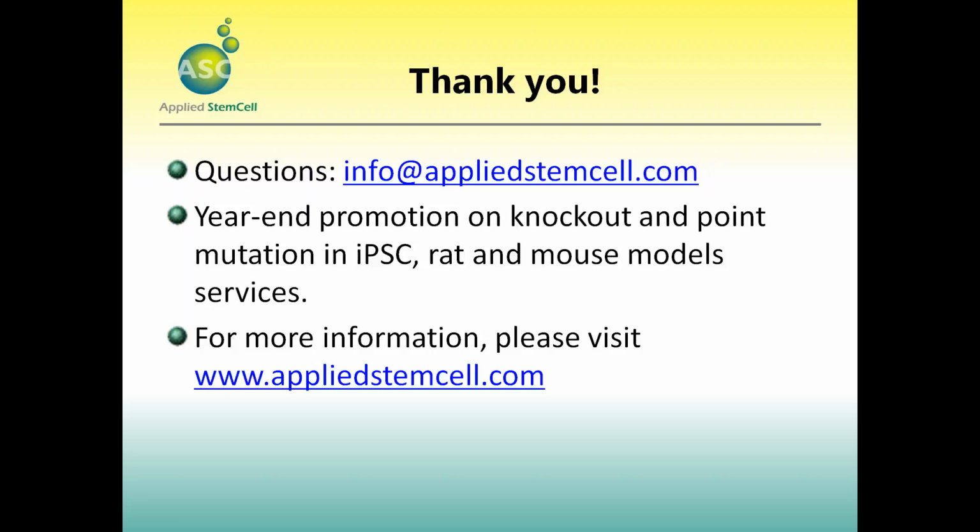So we have successfully inserted a 22 kb fragment without drug selection. And we are still trying to insert even larger fragments using this technology. And with a selective marker, as I mentioned, efficiency could be 100%, and without a selective marker, the efficiency could be 50%.